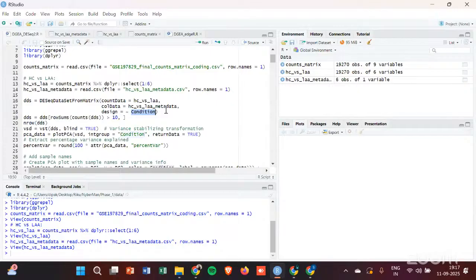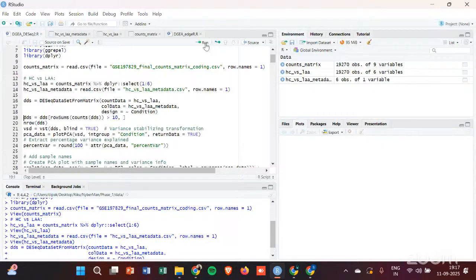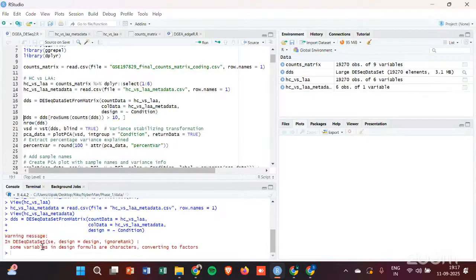You can then have differential genes based on both this condition as well as your gender differences. So that is also allowed. You can check out the DESeq2 documentation or the paper to see how they do it. But since we are learning the most basic RNA-seq pipeline here, I have not gone into all those complexities. Now if I run this, it should create the DESeq2 object.